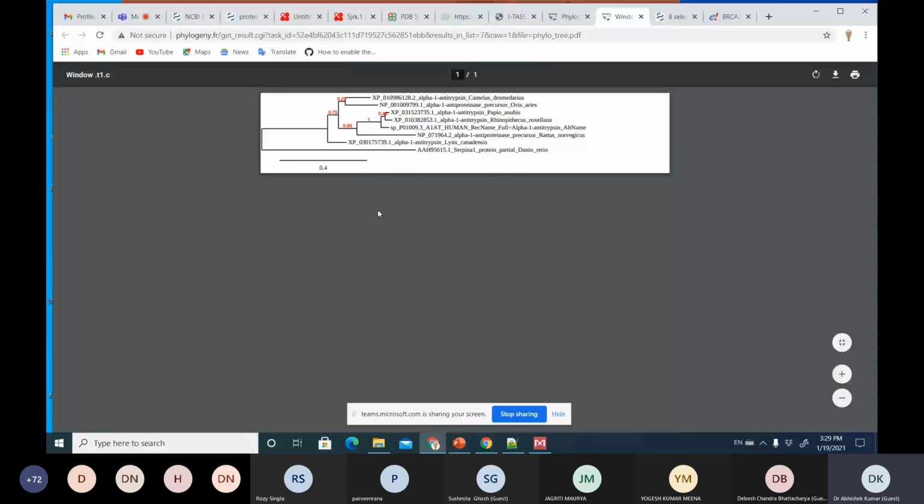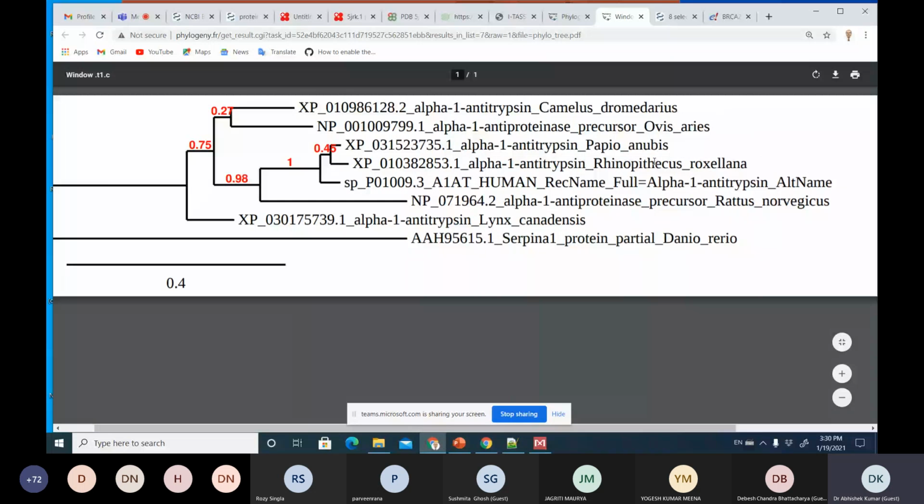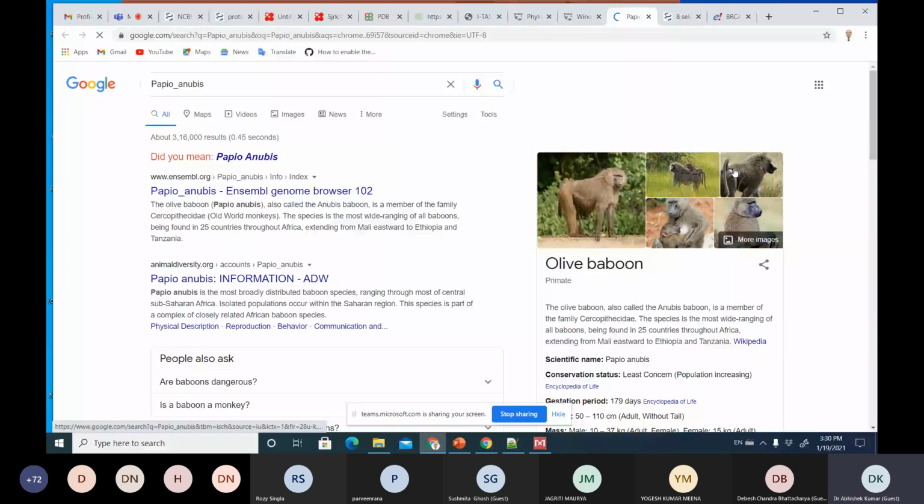So this one is taking care of this name, so that you know the camel. I think this shape. This I don't know. So you can have, or we can always go and have a look, because remembering a species name, I'm not giving an exam here. So obviously this is a kind of a baboon. So I don't normally try to remember this species name. And then what is this rhino?